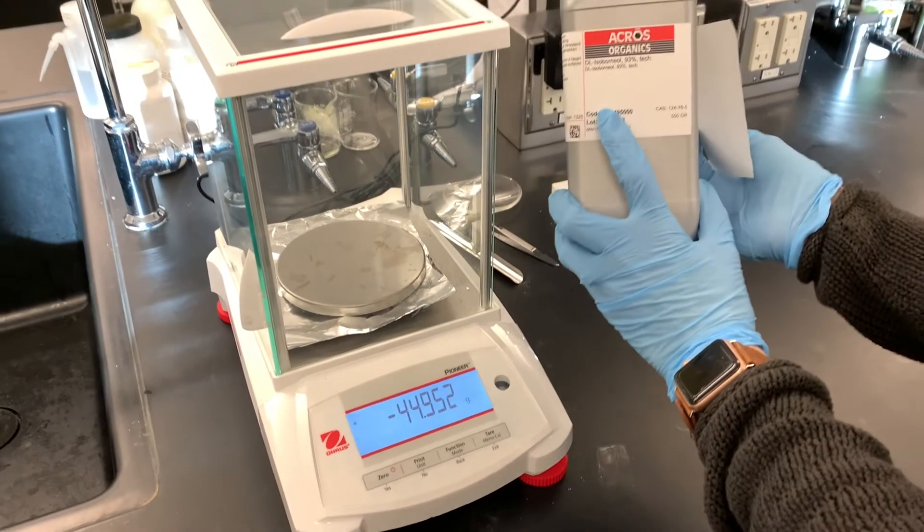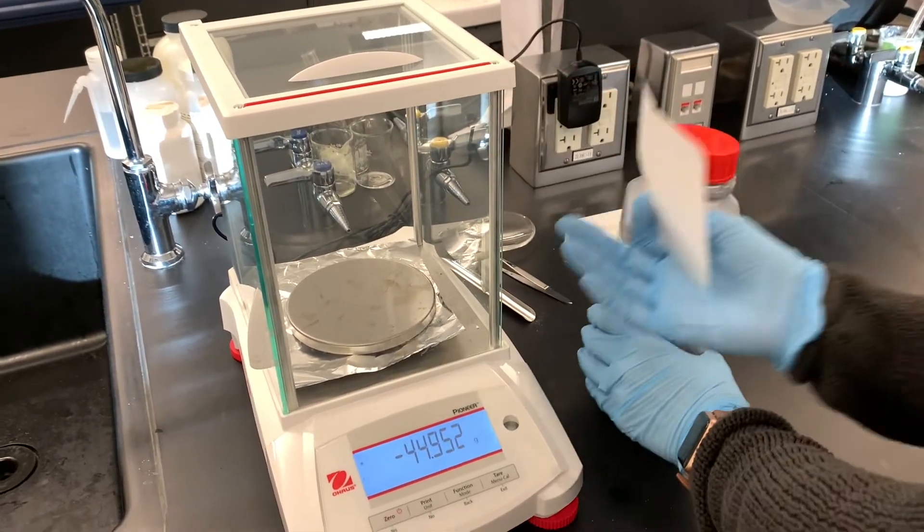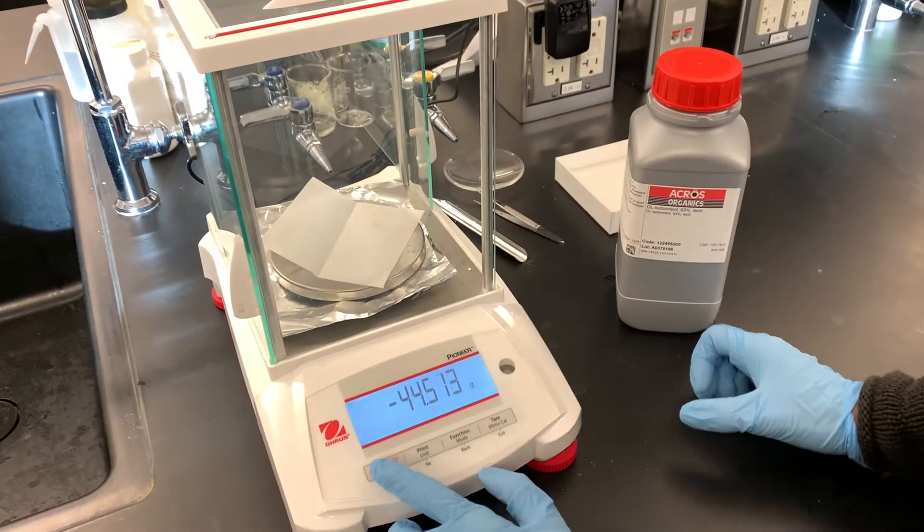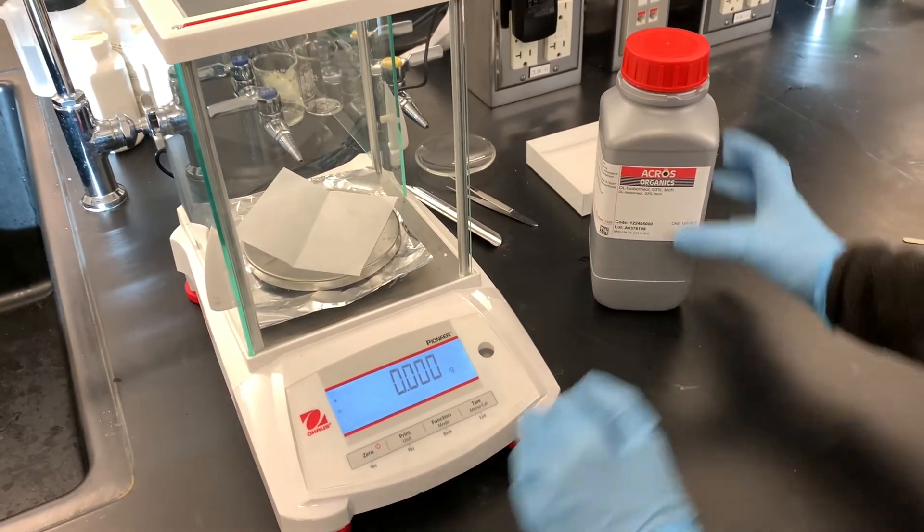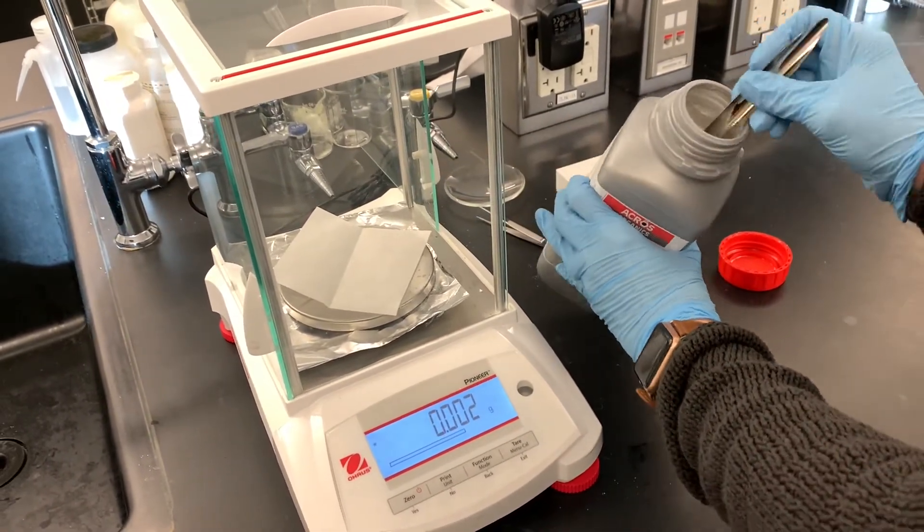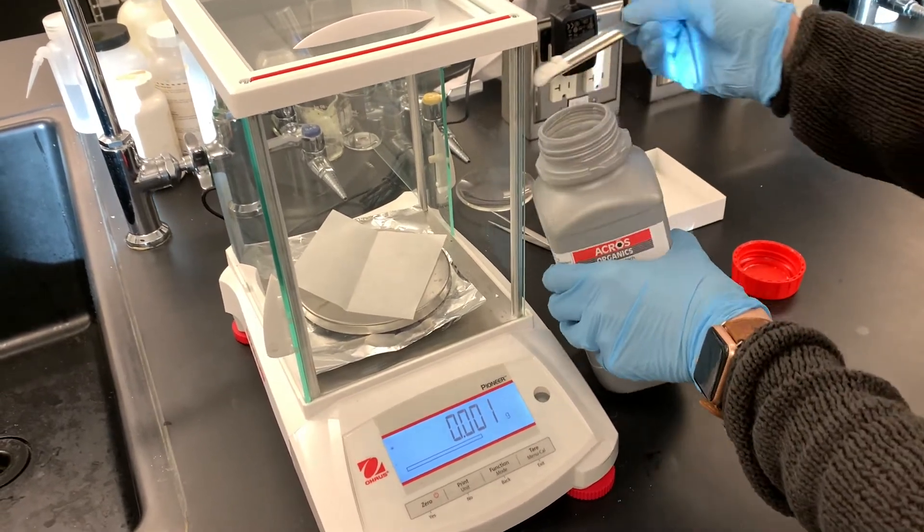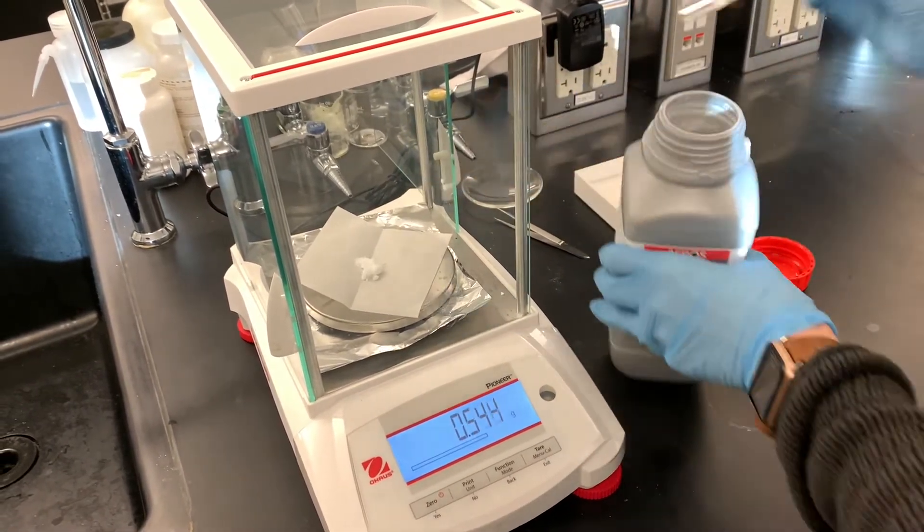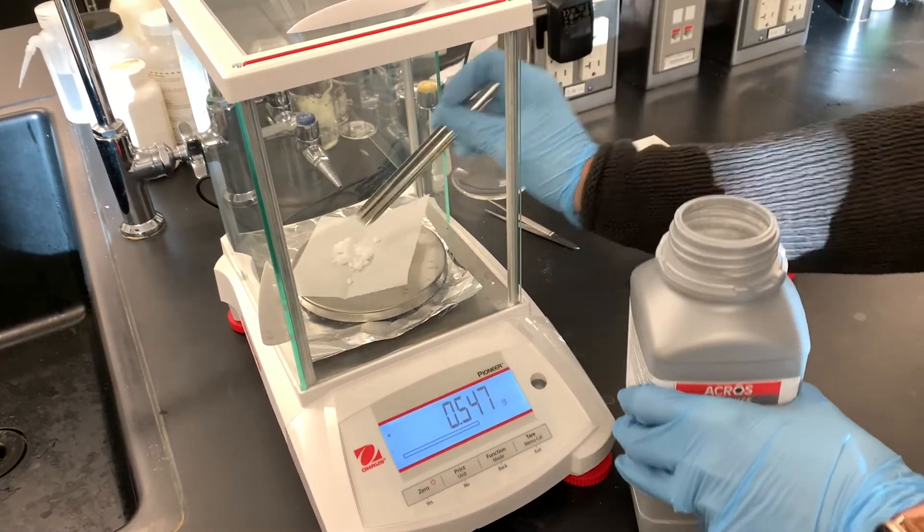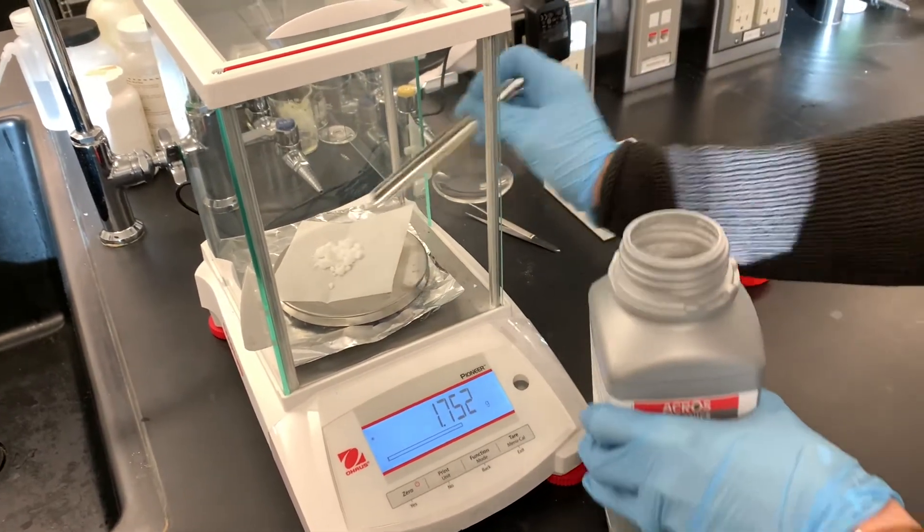We're going to weigh out about 3.86 grams of isoborneol. This is a really strong smelling solid, smells kind of like something that you would maybe rub on yourself if you had sore muscles. There are some pretty large chunks in here. I'm going to try to work pretty quickly to avoid having to smell too much of this.